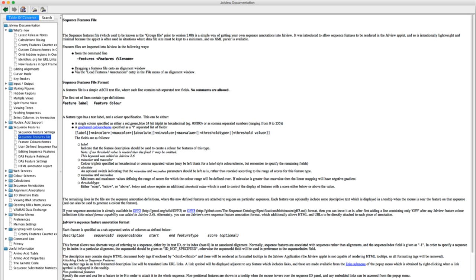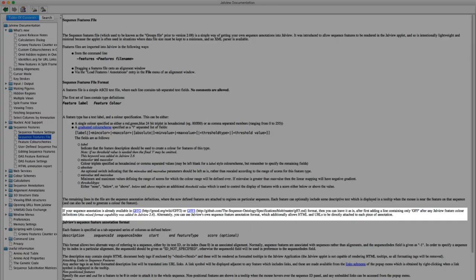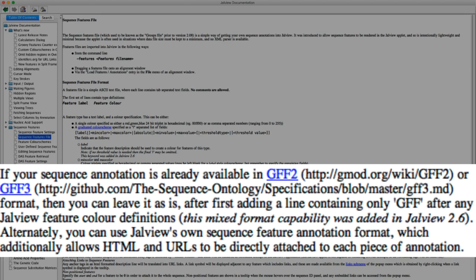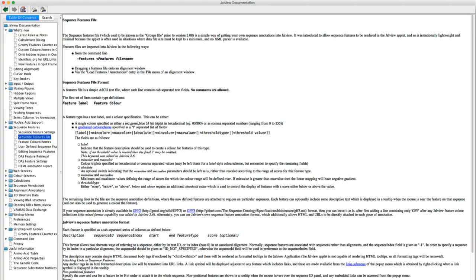The feature file is a simple ASCII text file where each line contains tab separated text fields. Note Jalview can also read GFF2 and GFF3 format files. The sequence feature file entry can be found in the sequence feature section. For more information about these file formats please look in the Jalview documentation.